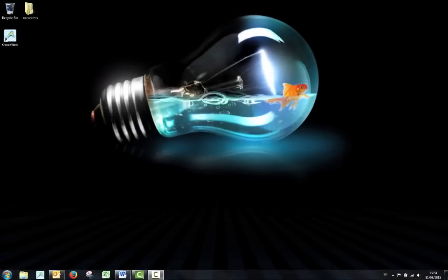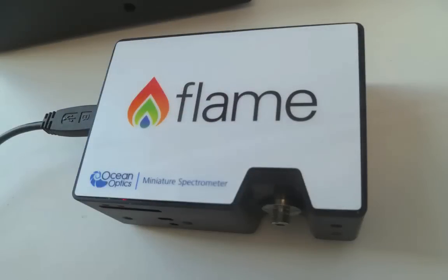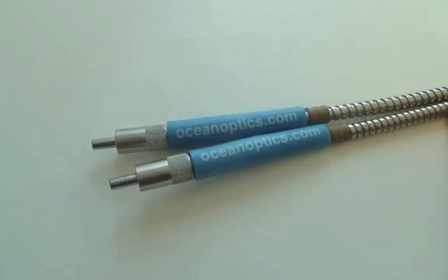The equipment used is as follows: The flame spectrometer configured for UV-Vis, two 600 micron UV-Vis patch cords with SMA connectors.